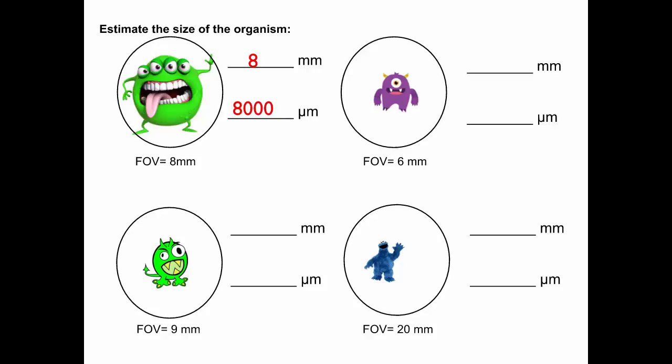How about this one? 2. Yeah, that's about 1/3, right? You could fit probably 3 across. Yeah, that's about 2 millimeters, 2,000 micrometers. How about this one? 3. 3?